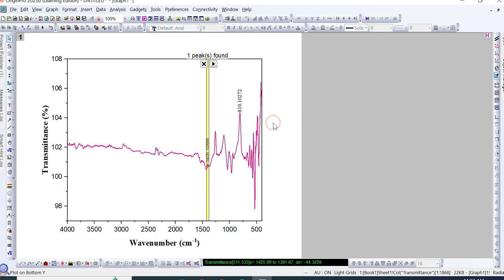Usually students want to remove this line because they want to add some other lines as well. For example, here you can mention this peak, but it looks messy when you assign all peaks. You need to present your FTIR spectra in a more attractive and captivating way. For this reason, you need to select some lines.